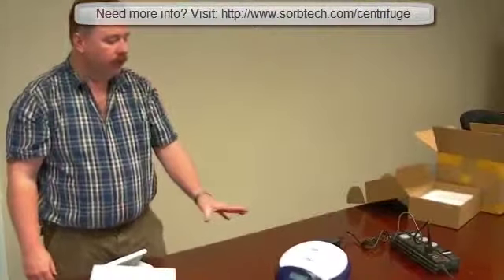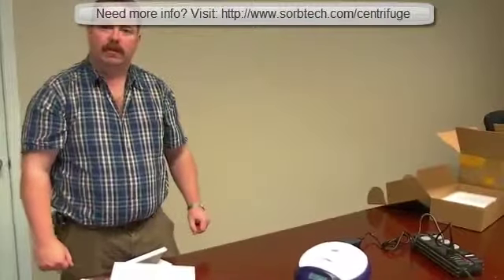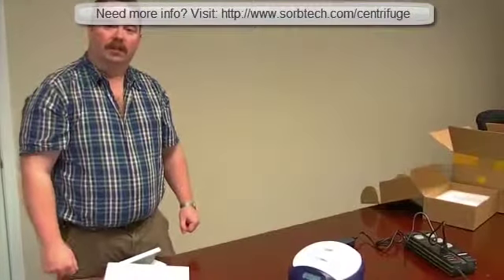It also has a very small footprint, which makes it really good for that limited bench space that we all have.